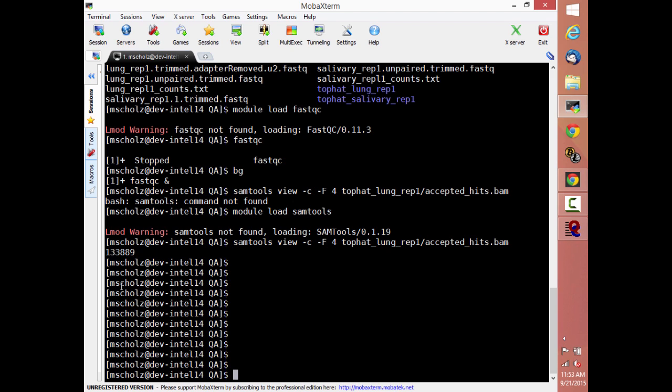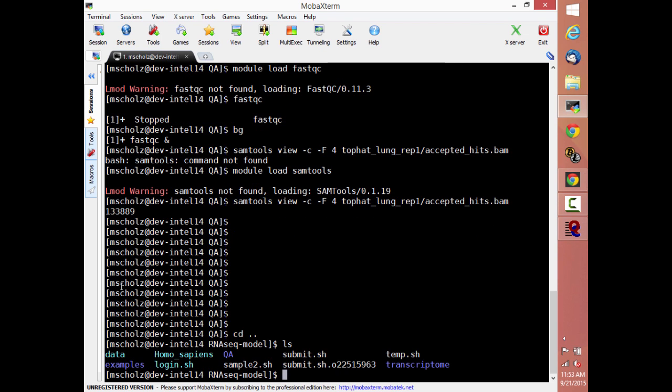We could, if we wanted to, at this point go forward and analyze 2 samples, 1 sample each, 2 conditions, in edgeR. I don't really want to because we have 2 more samples that we can work with. The next bit and piece in this is to see if we can make a new version of sample 2 that looks like sample 3.